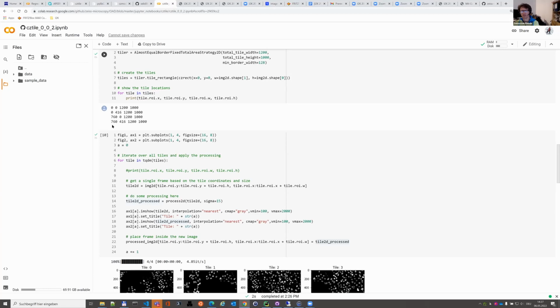See what you can do with it. But this is more or less, I would say, already it.